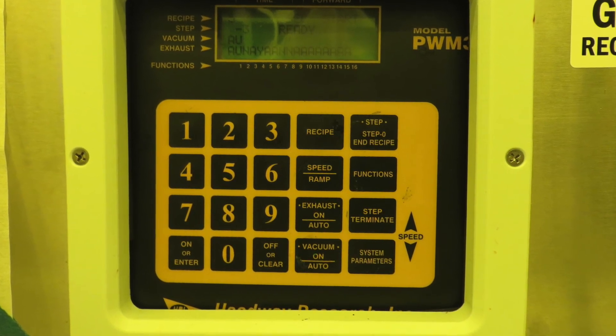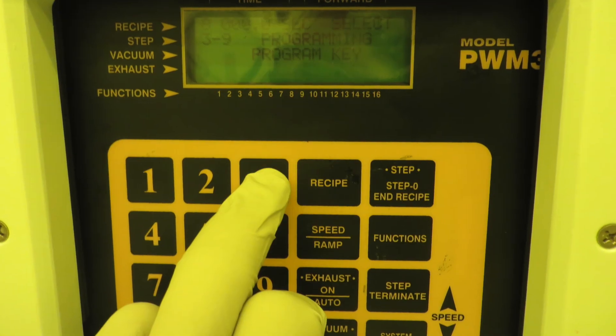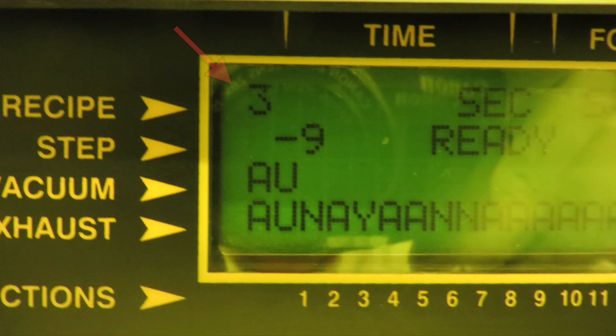So say you want to use recipe three, but you find that it's sitting on recipe eight. All you need to do is hit recipe and then three, and that's it. Now it's in recipe three and it says ready, it's ready to use.